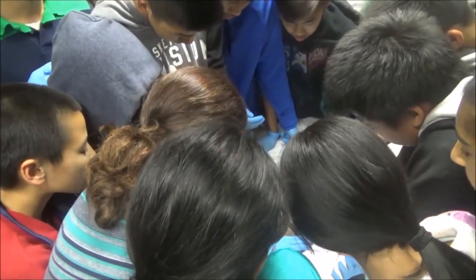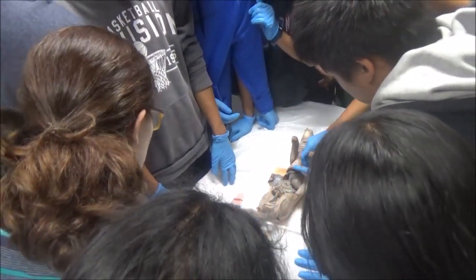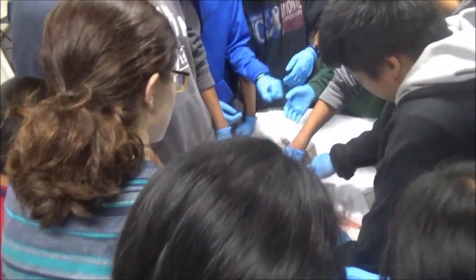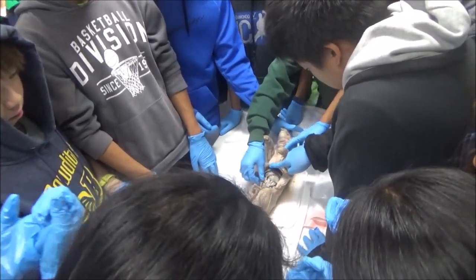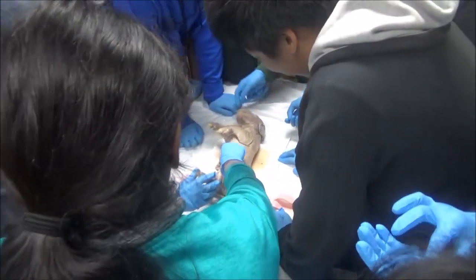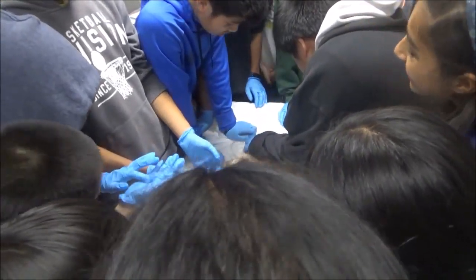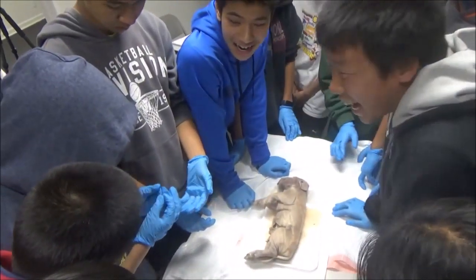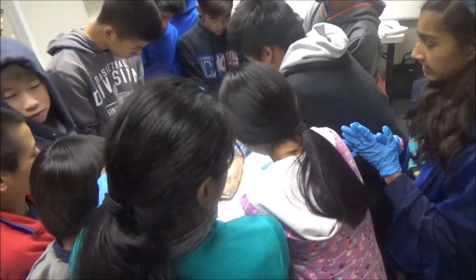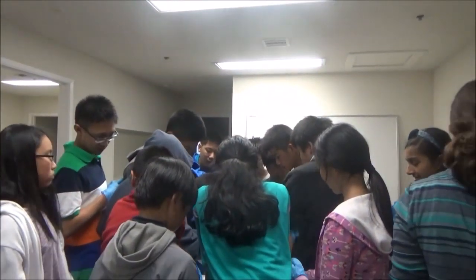Do you see how this kind of has a cottage cheesy texture to it? Like that has a very smooth texture and that has a cottage cheesy texture. Feels kind of granular. That is a piece of the pancreas — all glands that release hormones are going to have this texture. The cottage cheese texture. The adrenal glands, the thyroid, the thymus — all glands that release hormones have this texture.